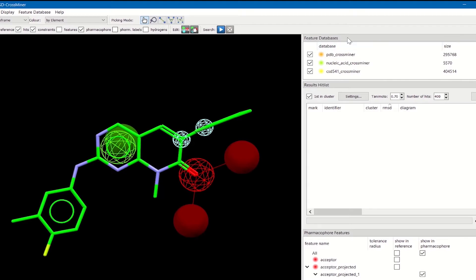On the top we have a feature database window that contains information about the loaded feature database. In this case it is displaying the default feature database provided with the application, which consists of three subsets: the PDB, nucleic acid, and the CSD subset.